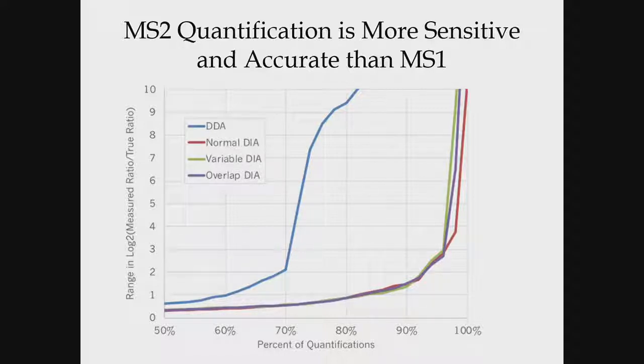What we've found is it's easier to detect a peptide using narrower isolation windows, but the effect on the quantitation hasn't been that bad either way. The reason is, let's say you have a 20 amino acid peptide. You basically have 40 fragment ions from the B and Y ion series that you can choose to use as being reflective of that peptide sequence.